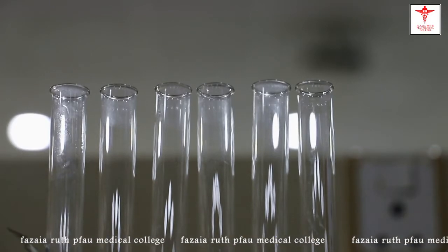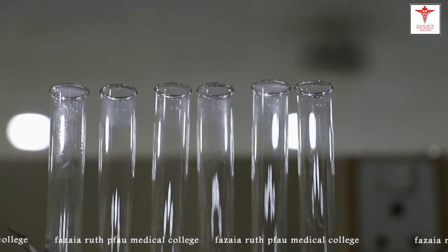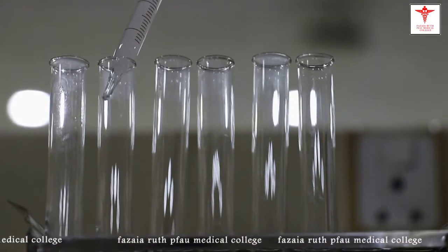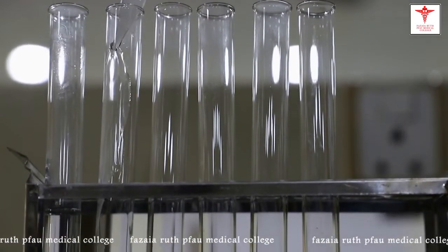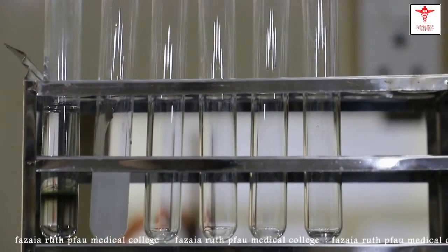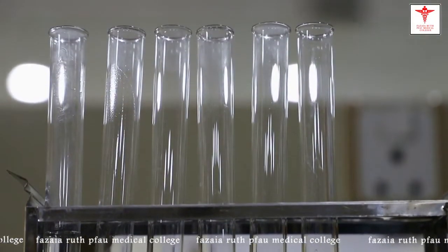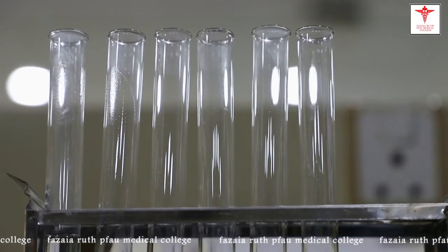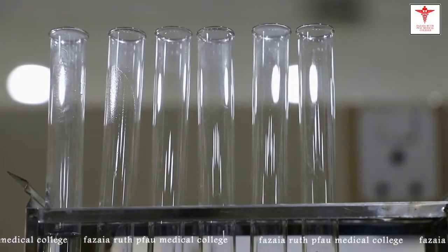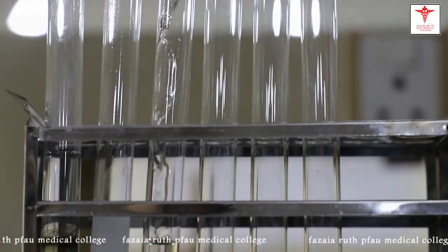And the purpose of performing this test is detection of polysaccharide in the given sample. I have explained to you earlier that iodine is not a chemical test, but it's more of a physical test. So for iodine test, we will take 5 ml of original solution. So here we are taking 2 samples. One of the samples contains a polysaccharide, and the other sample does not contain the polysaccharide. It contains other monosaccharide or disaccharide sugar. So we now add 5 ml of the second sample to another test tube.